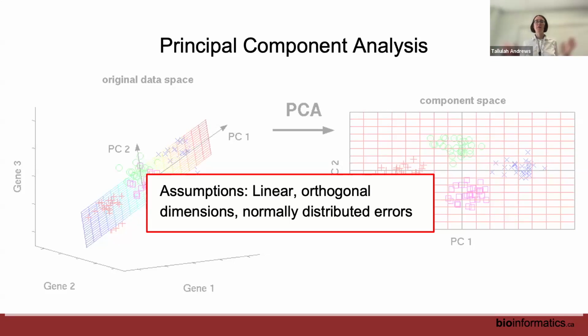And it's also why most of the time we're not looking at our data in PC space, because the first 2 principal components are not going to be showing all of the interesting features of our data. And we'd have to make plots of the top 20 principal components to really see all of the interesting aspects of our data. And now we've got a giant page full of PCA plots.